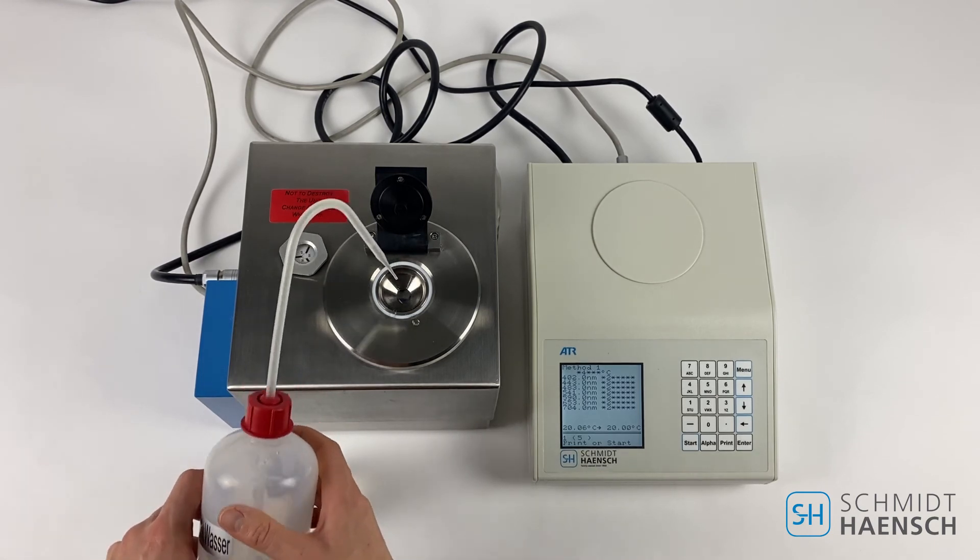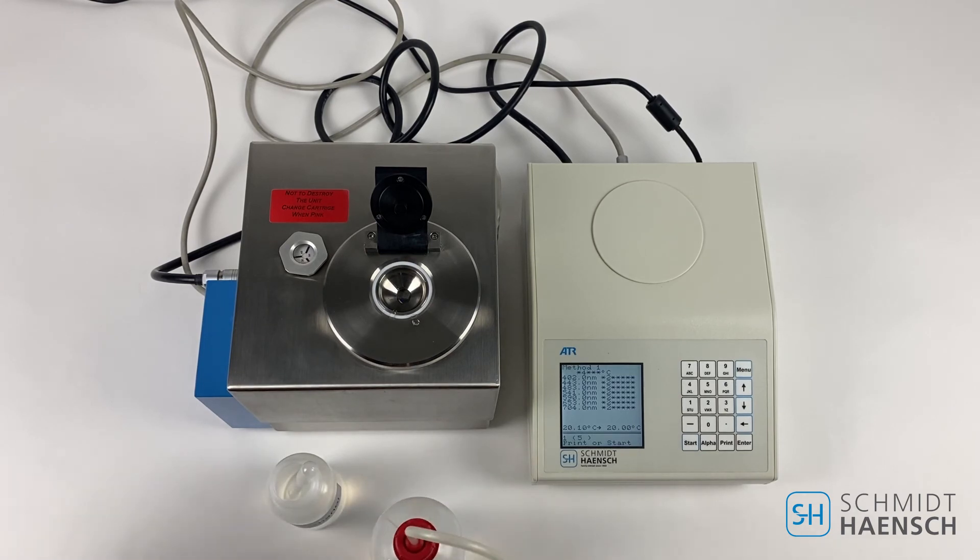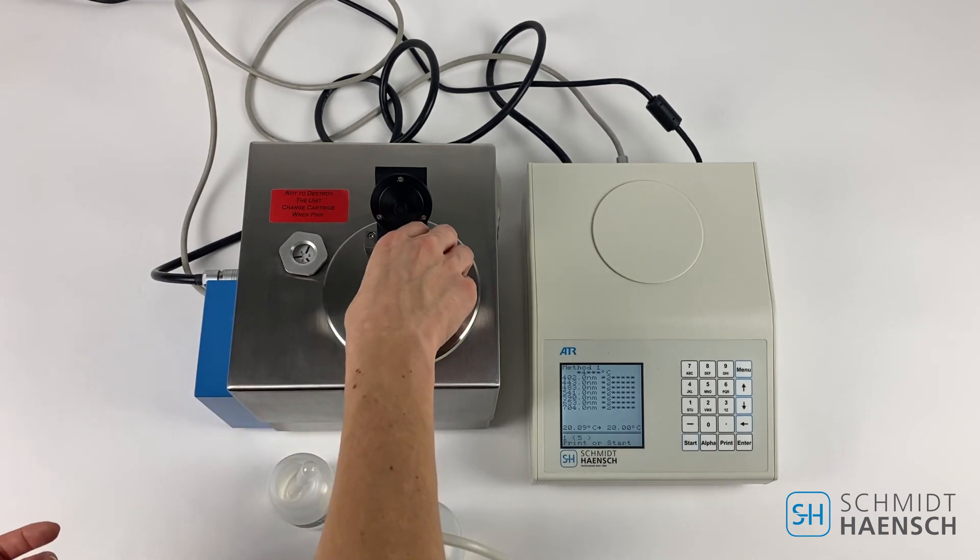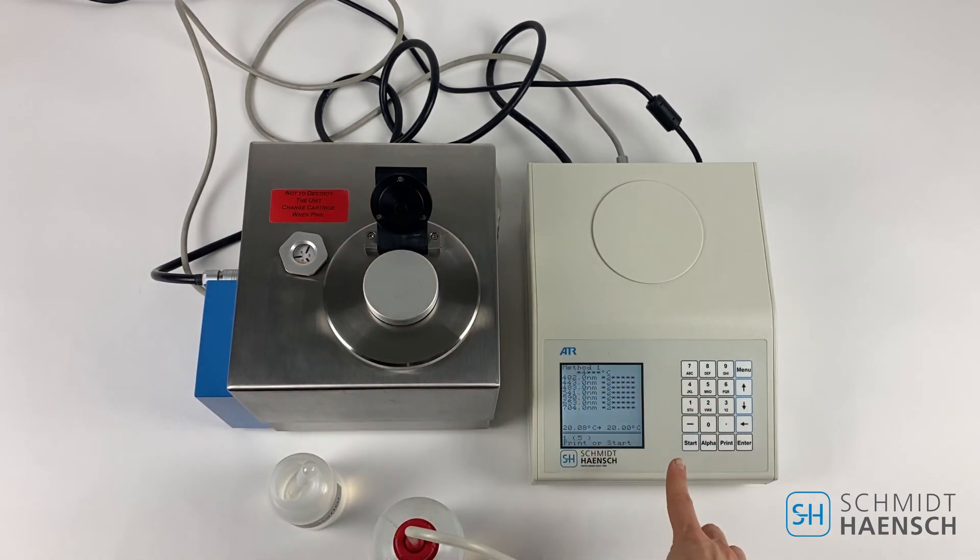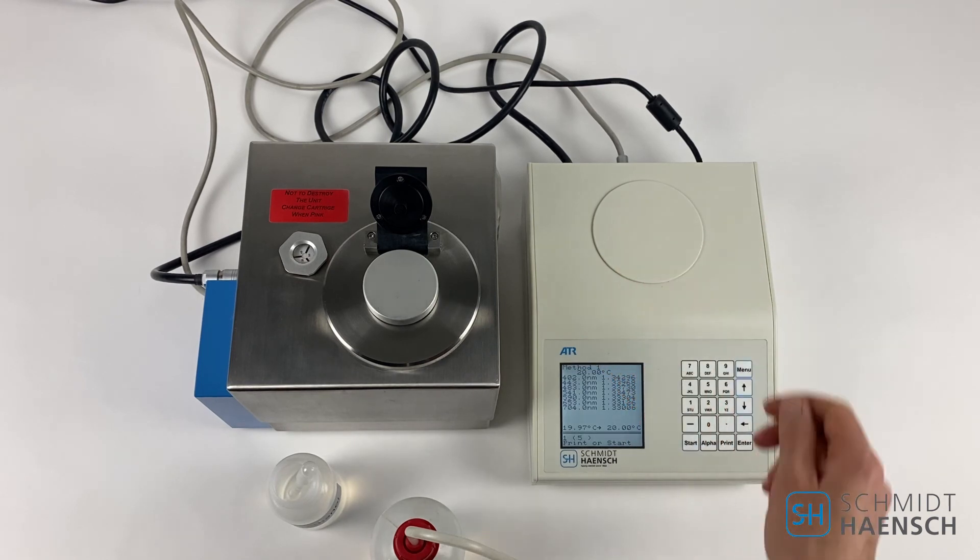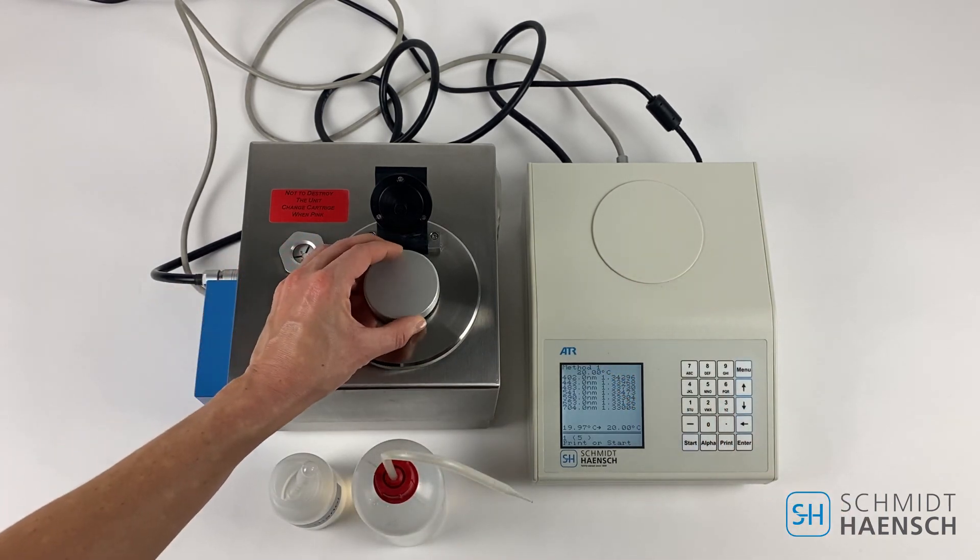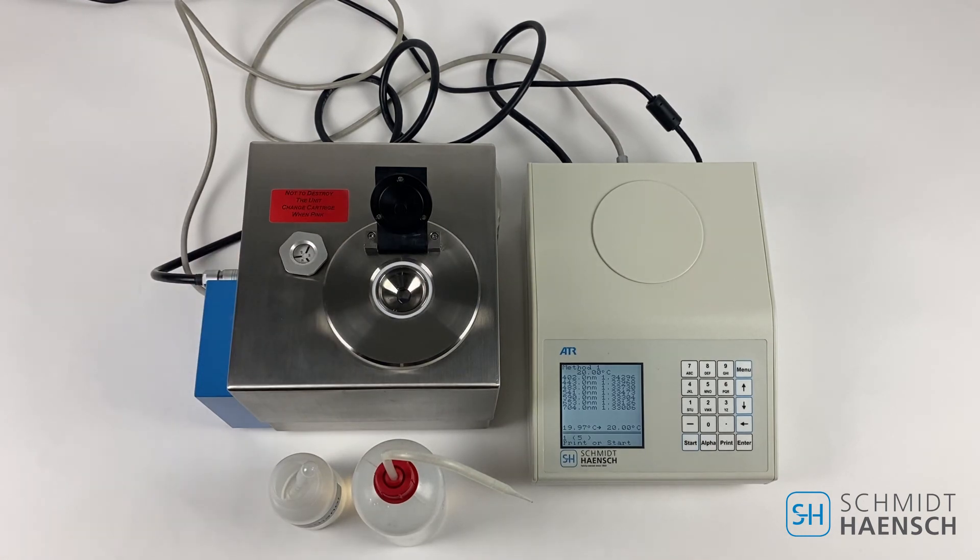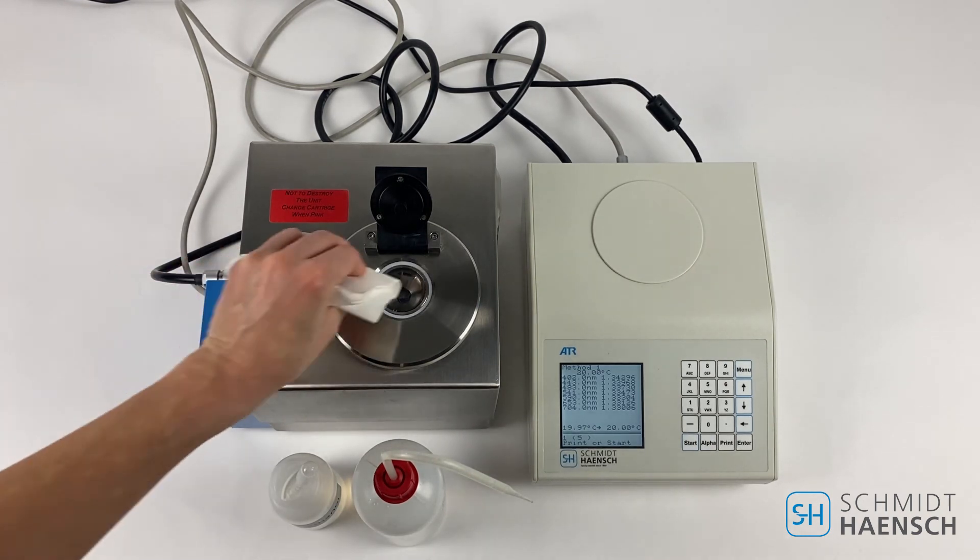Close the lid and measure. The distilled water should be showing 590 wavelength and 1.333 refractive index. Then our instrument is calibrated correctly and measuring correctly.